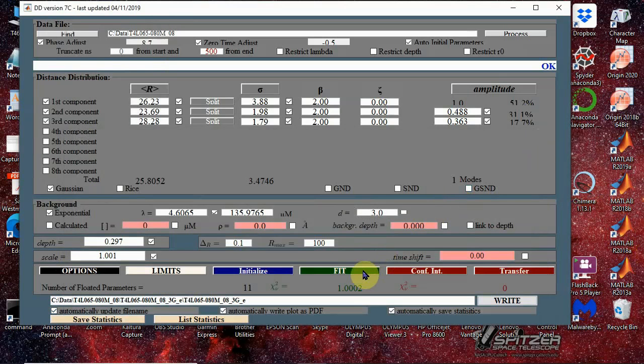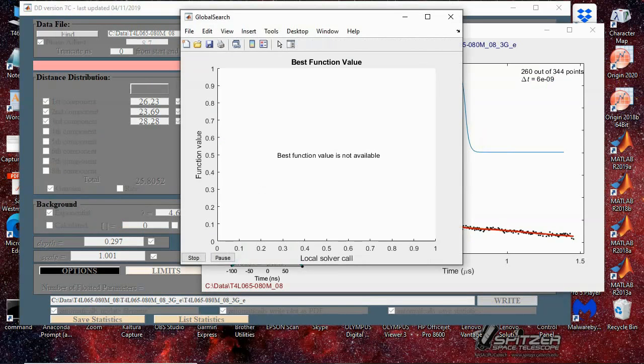Now this is going to take quite a bit of time. I'm going to start this, pause the video, and then I'll restart the recording in a few minutes. So we'll hit fit.